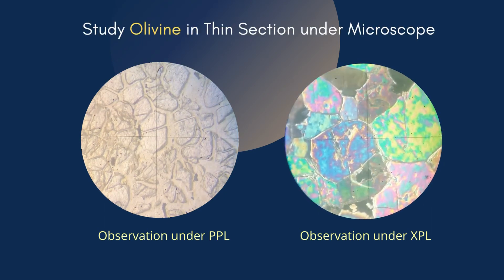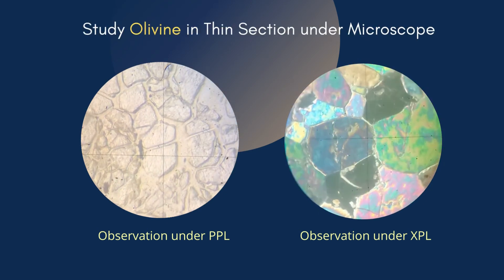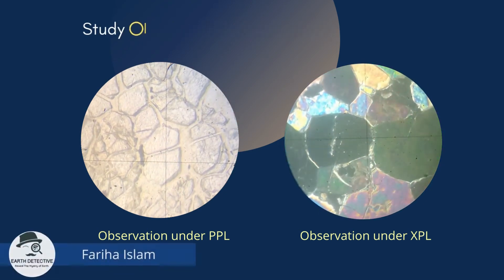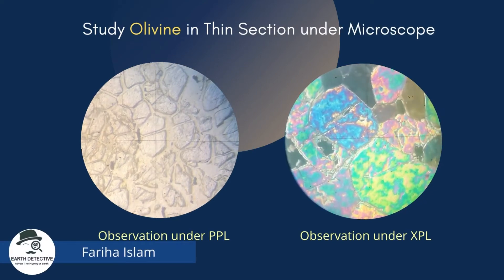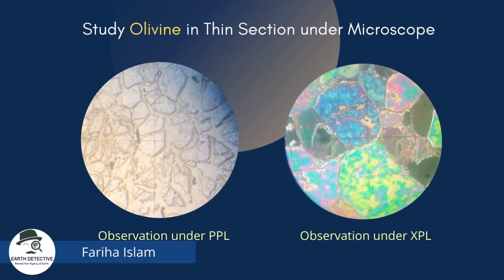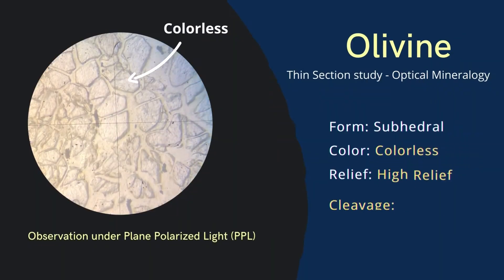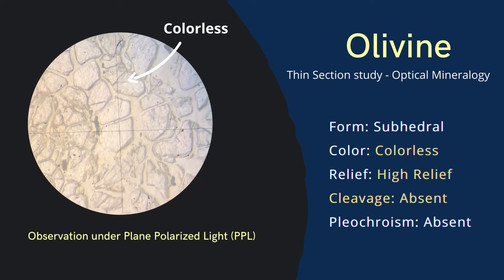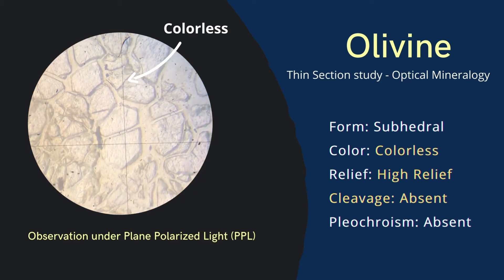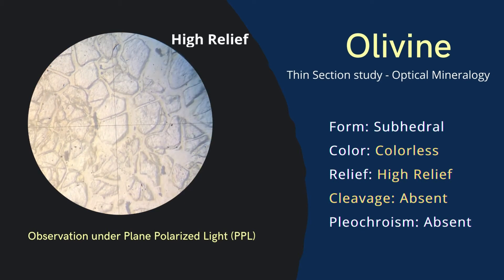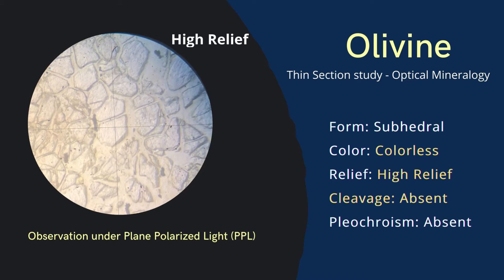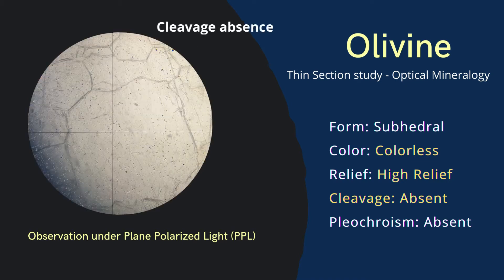Hello everyone, welcome back to Earth Detective. Today we're going to study olivine in thin section under the microscope. You can identify olivine by its colorless appearance, high relief, and absence of cleavage under plane polarized light.